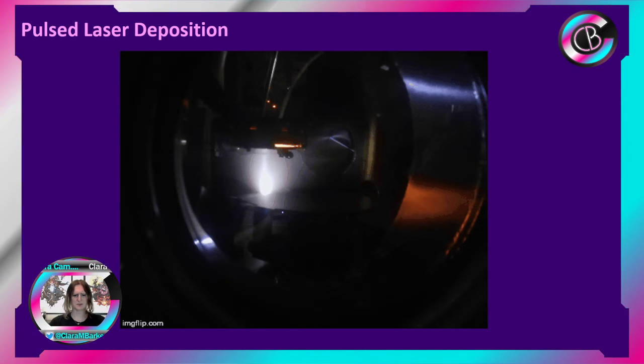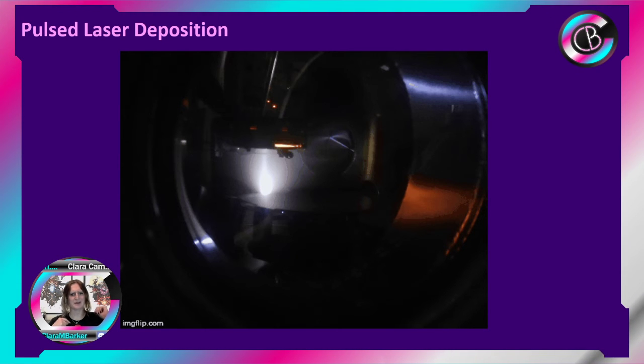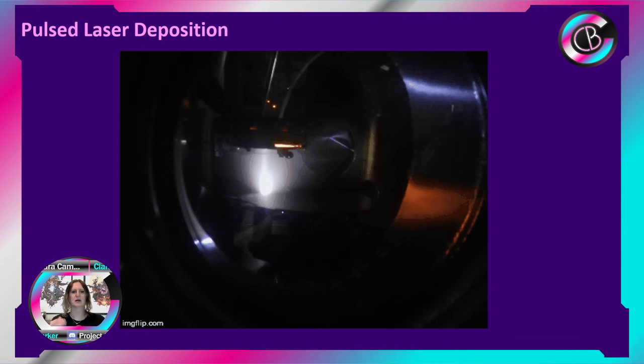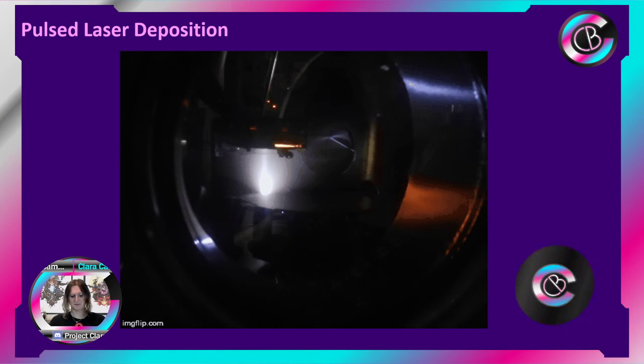But what's nice about pulsed laser deposition is it's a fairly slow process, so it takes a long time to grow films, but it is quite repeatable. So if we make a film on a Tuesday and then we make one 6 months later with the same conditions, chances are we're going to have basically the same film. It should have very, very similar structure and therefore properties at the end. So yeah, that's basically what it is.